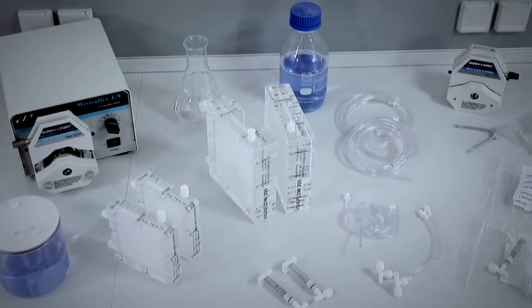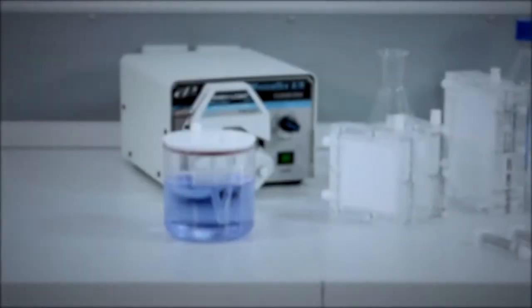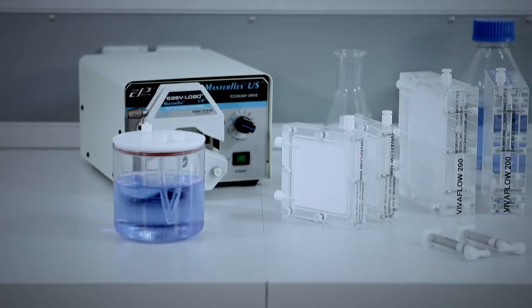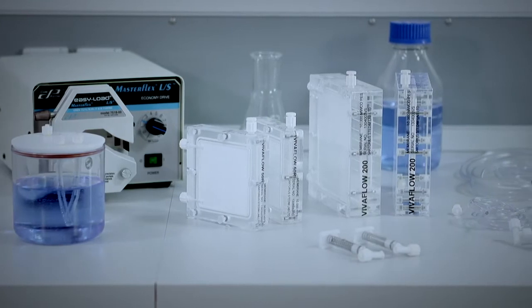They are convenient to operate using a laboratory peristaltic pump. VivaFlow units are so straightforward that they can be intuitively used and need only very few accessories in order to operate.